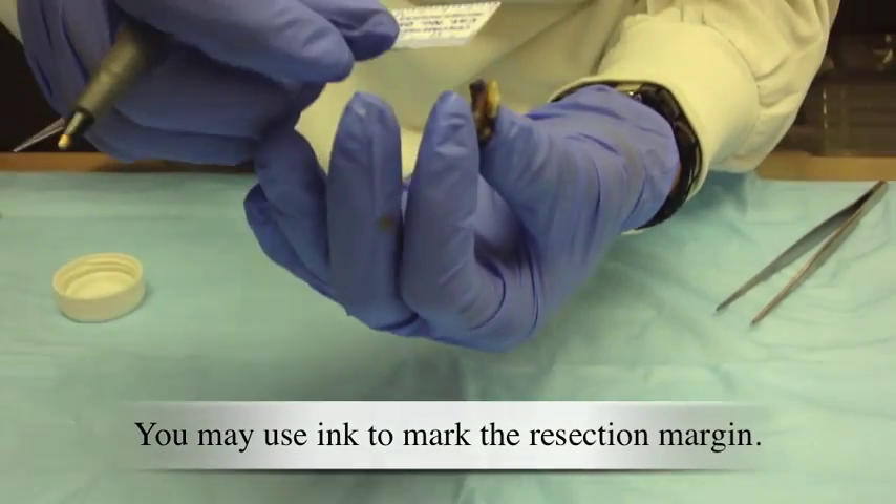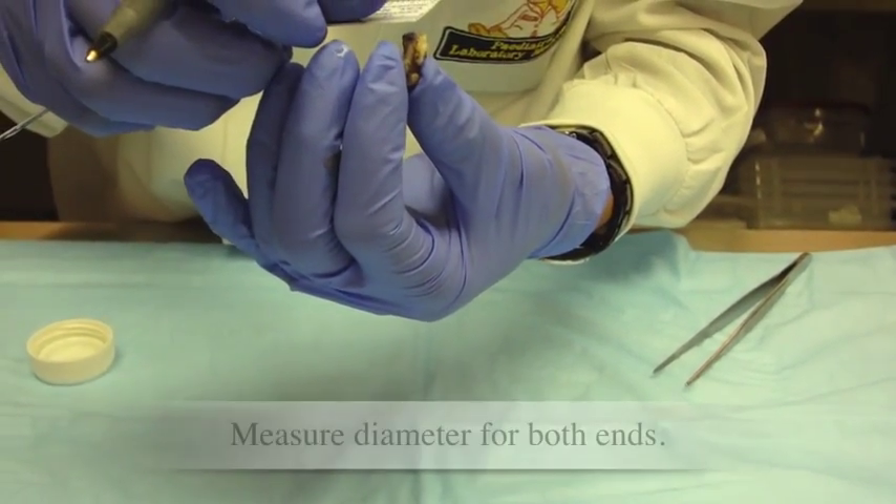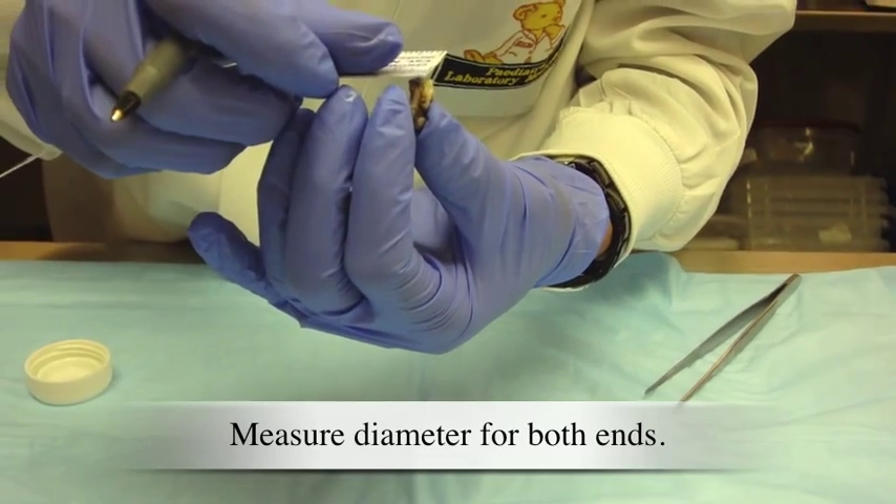You may use ink to mark the resection margin. Measure diameter for both ends.